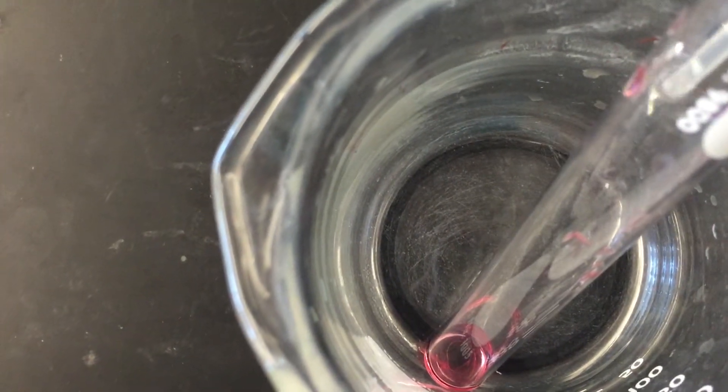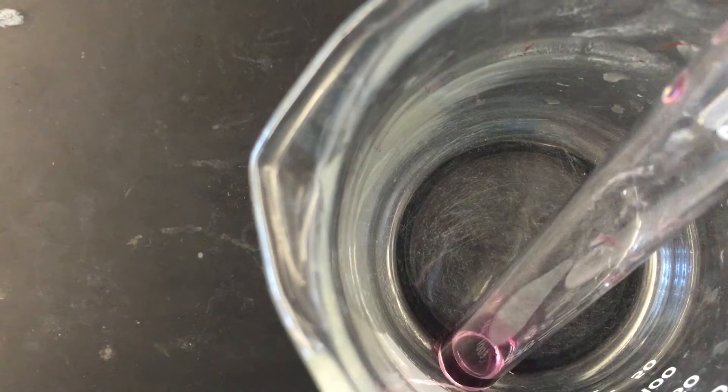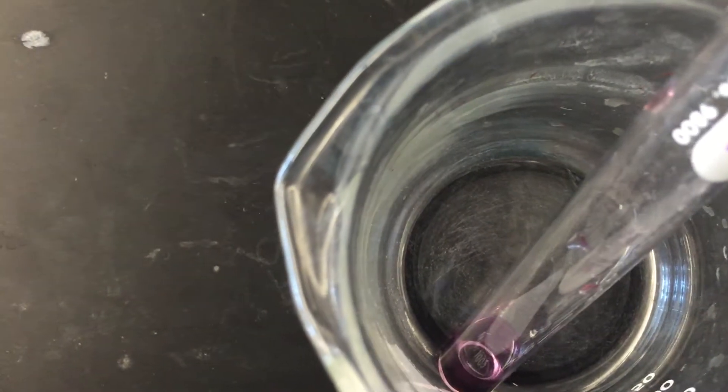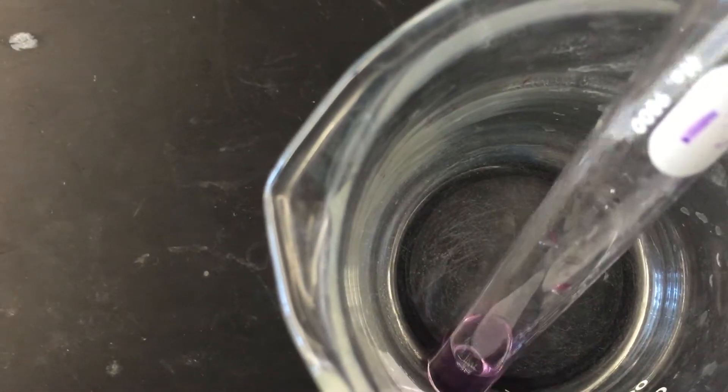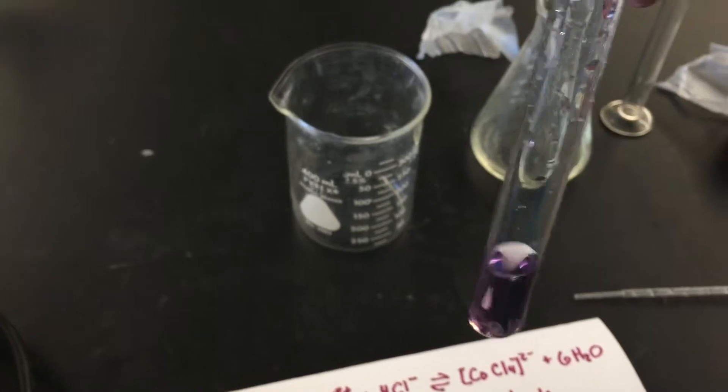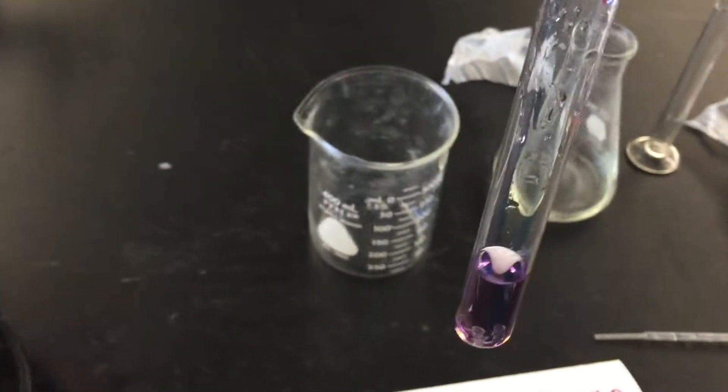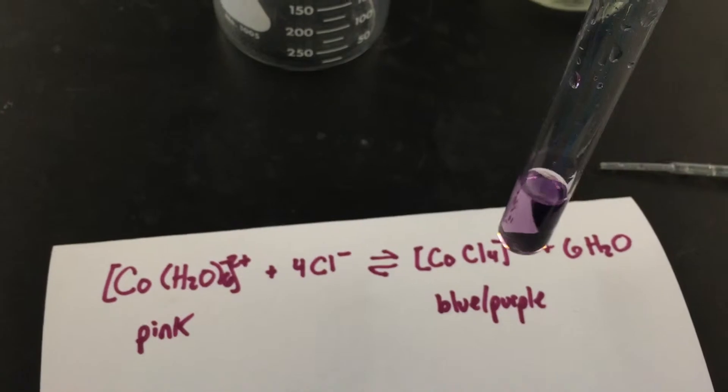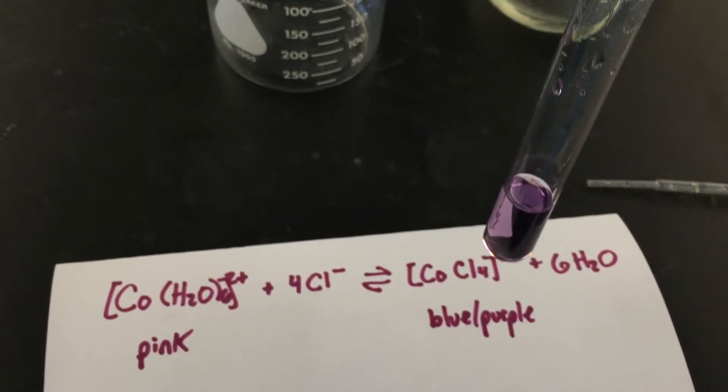I'm adding HCl right now. I don't know if you can tell, but I now have a purple color to my solution. Now that I have a purple color to my solution, I have more of this cobalt complex.